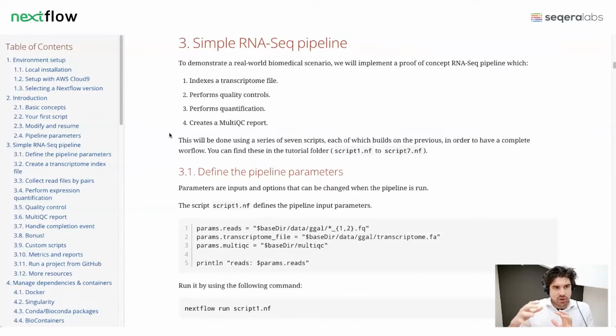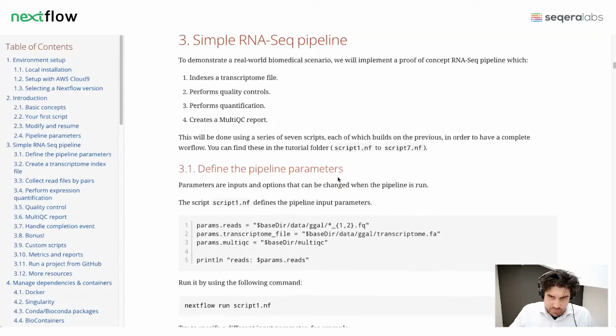This is a fantastic pipeline in the sense that it shows you each of the individual steps. They're all doing something different, but it's also a common pattern of basically running something once. Some things you want to run for every file. You want to run that in parallel, collect all of that stuff, and then create a report. So basic things.